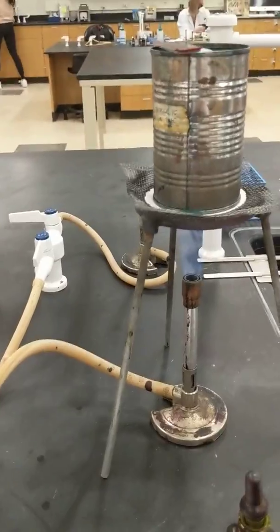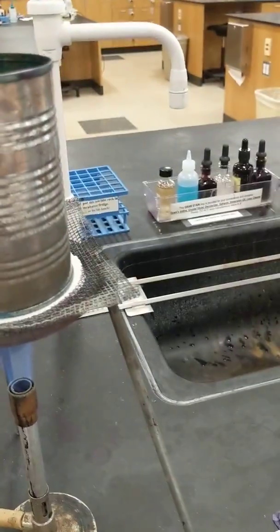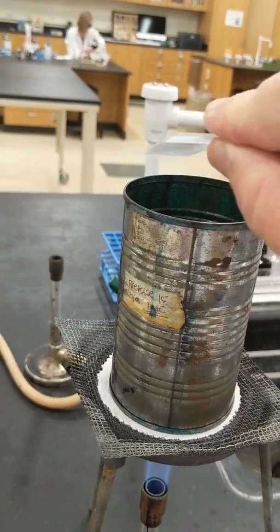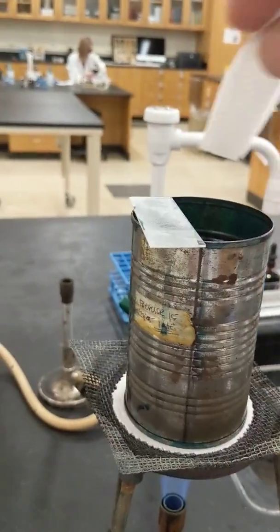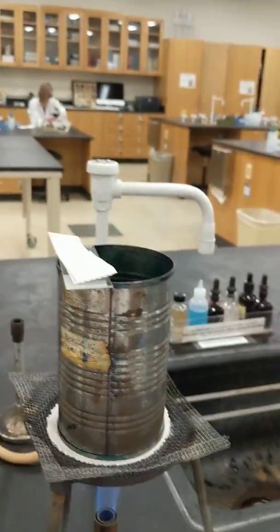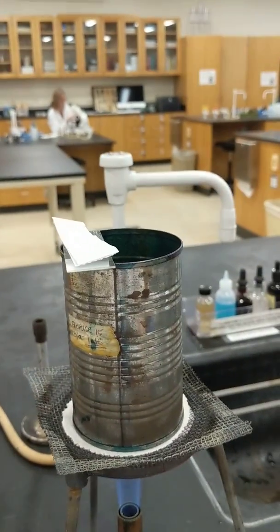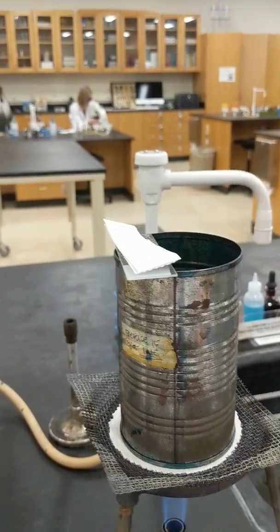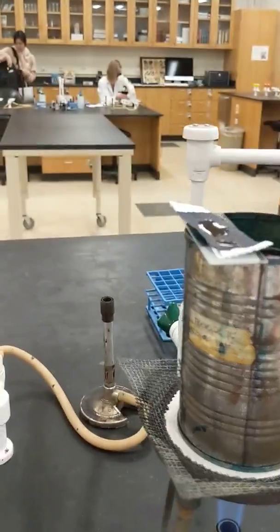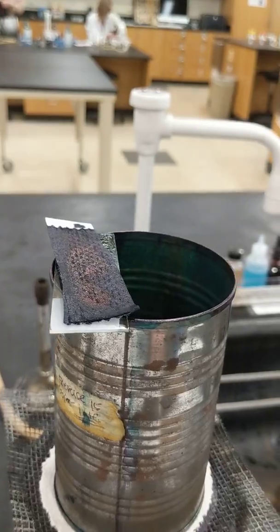Okay. For the endospore stain, I'll go ahead and take that off. Again, it's very hot. For the endospore stain, you would do the same thing, only this time you're going to be using the malachite green. Same thing, you put the malachite green on and make sure it is moist the whole time. But try not to get the malachite green all over the place. If you notice I'm not getting it all up here, make sure you clean it. Make sure it's moist for the time that you have.